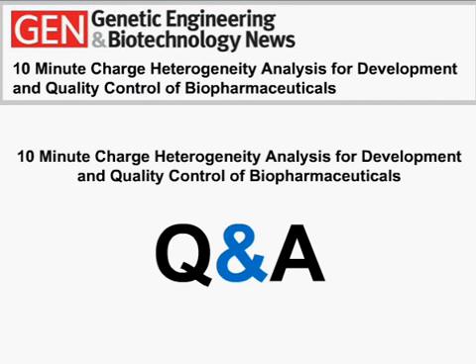Typically, I'll use between 2 and 4 molar urea to make sure that I don't get any aggregation or precipitation events. If resolution isn't sufficient, you can then add in 8 to 10.5 Pharmalyte, and I typically start at about 2%, pulling back my 3 to 10 Pharmalyte from 4% back to 2%, so I have an equal volume to weight ratio for the ampholytes.